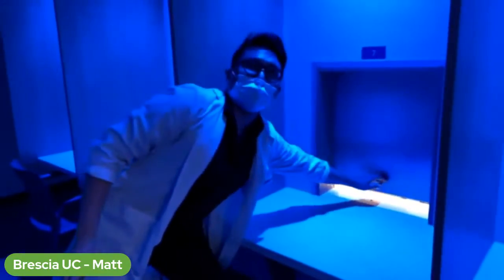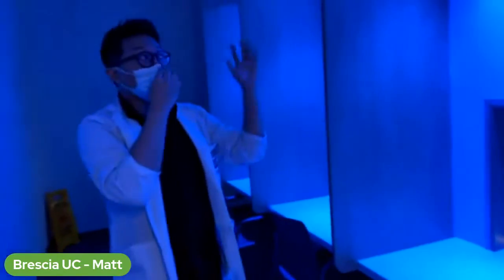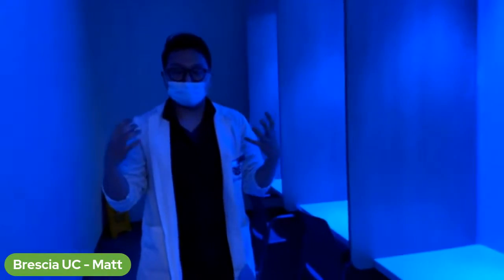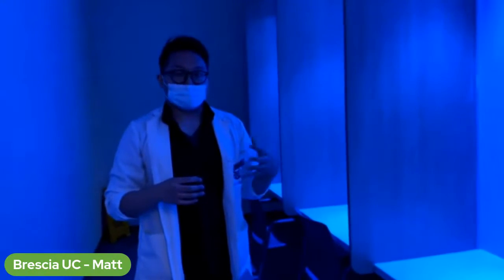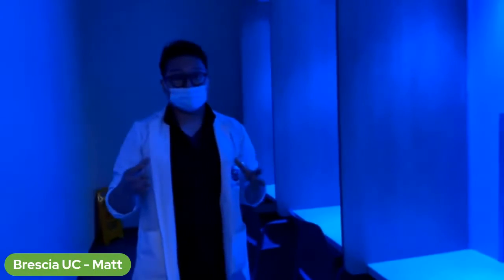Now, you're probably wondering why we have the different lights there. Like, why is it blue? Well, actually, we could control the color of the light, so that can be any of a million colors of the rainbow. Typically, when we're doing food tasting, we would use normal white light or daylight, sometimes red light, because the different colors will actually mask how the foods look under a certain light. And I'm going to show you an example of that right now.